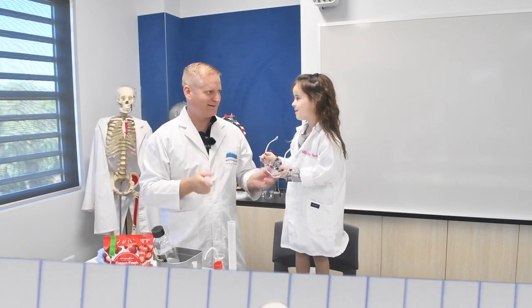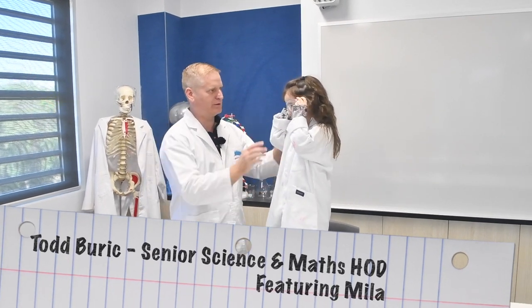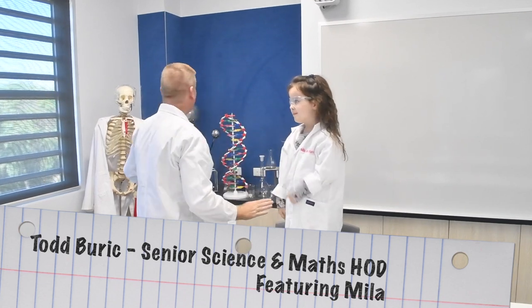All right, let's start the science experiment. So, we've got our safety equipment on. Got your safety glasses, your lab coat.